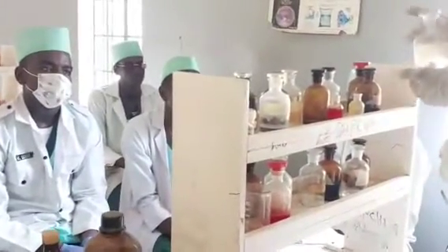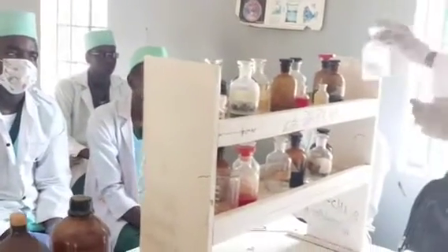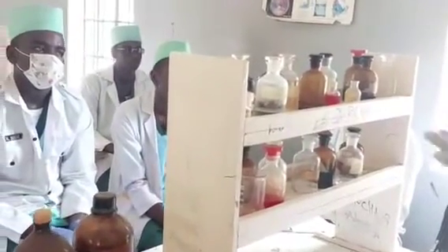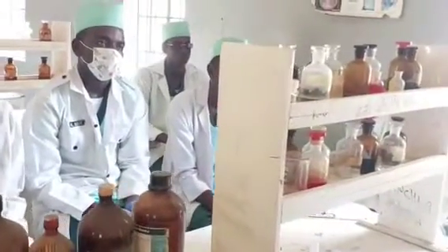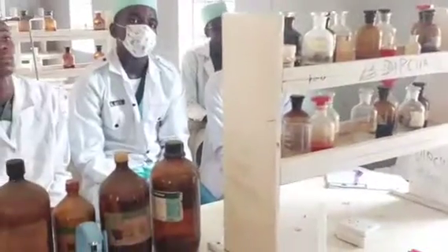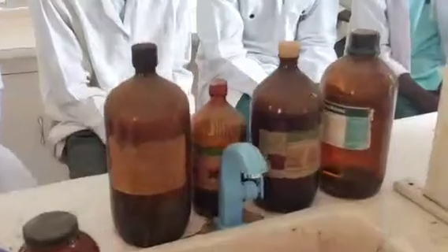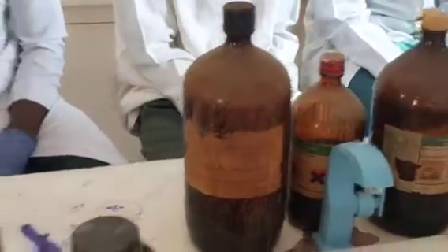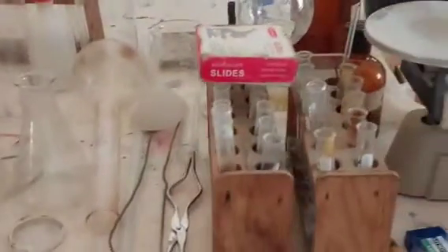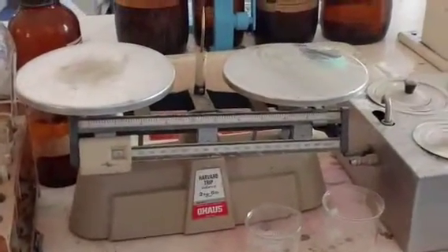Because maybe it's not dilute hydrochloric acid. Someone just tried to add it inside due to poor practice. So if you are not the person that prepared any reagent, you should not touch. Even if you are the one that prepared it, you should not smell or taste. But if you are not the one that even prepared it, don't even come close to it. Don't touch it. So this is a very good precaution to be taken.